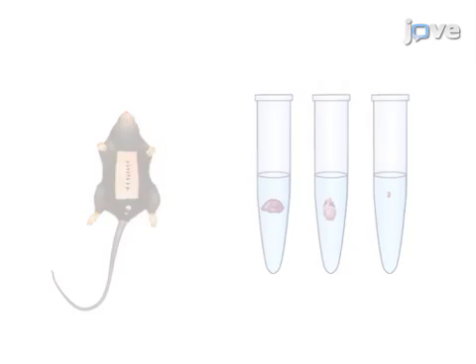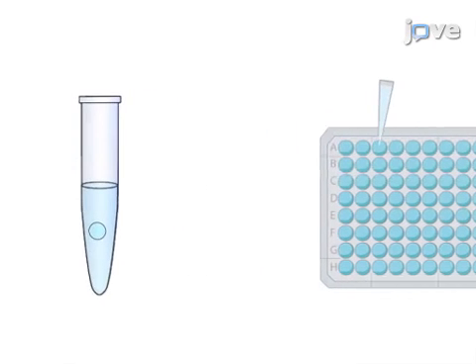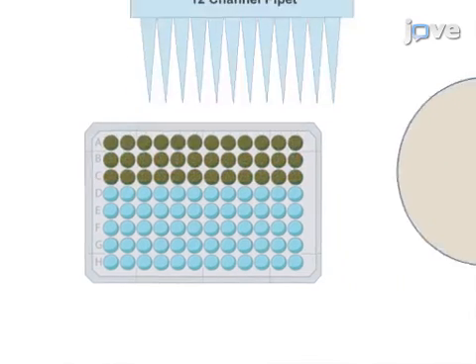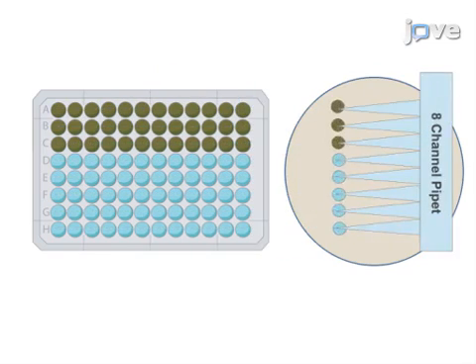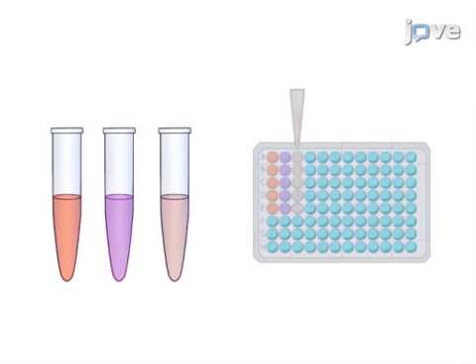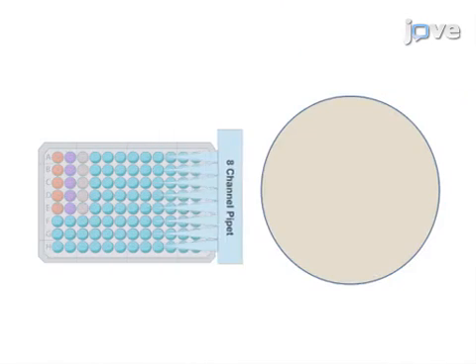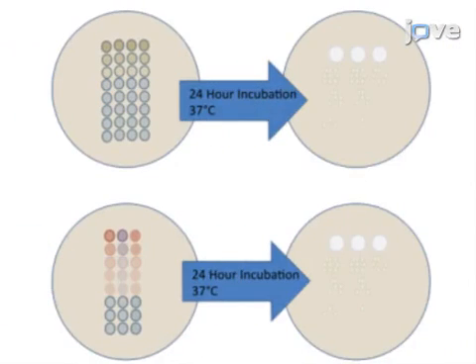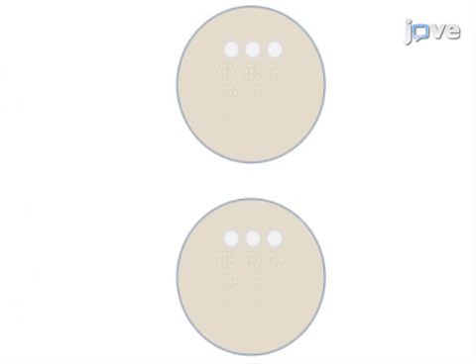organs. Finally, cell and organ suspensions are diluted and plated using a spot plating method to determine the numbers of viable bacteria associated with cells or target organs. Ultimately, bacterial colonies are counted on agar medium to determine the efficiency of cardiac cell invasion for cells grown in tissue culture, or the efficiency and extent of cardiac infection in animals.